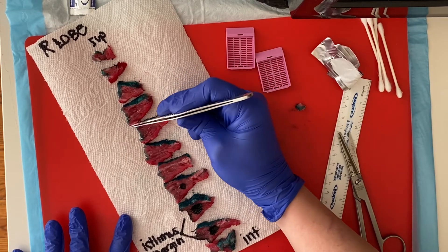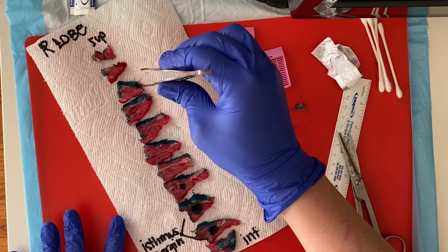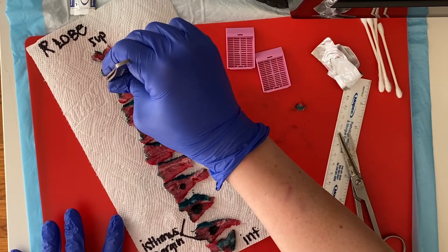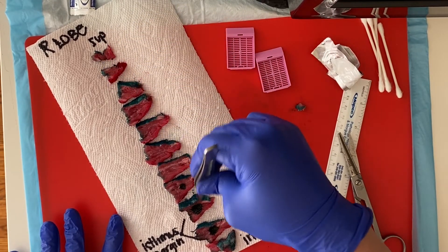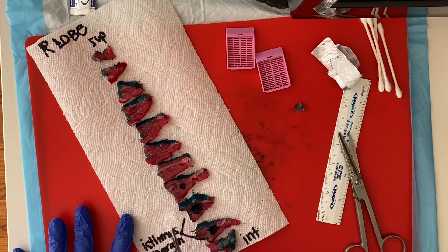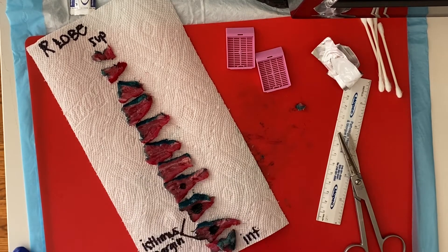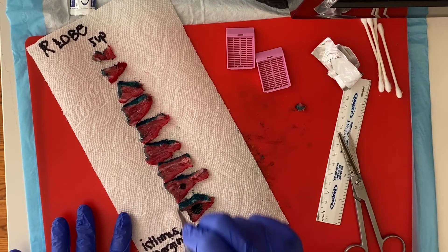My green ink is anterior, my red ink is posterior. All of these slices are laid out the same way — green and red are in the same plane, so it's easy to maintain orientation. I've also labeled which slices contain my black-inked isthmus margin. You could take a gross photograph here so that your pathologist could identify everything.